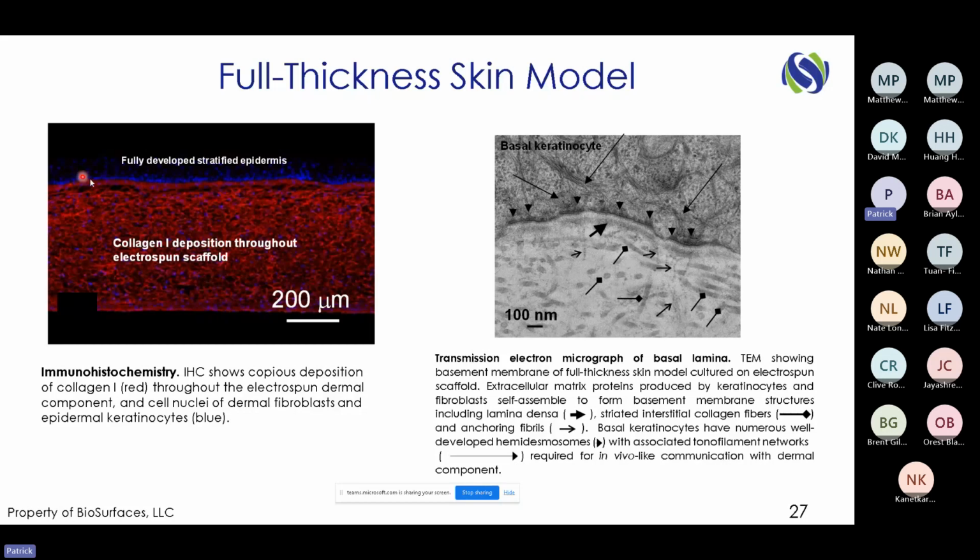And of course, this is where the epithelium is, and you can kind of see the Hoechst dye of the nuclei of those basal epithelial cells at the top. And then here's the basement membrane zone that I alluded to. It's very important to have a good basement membrane in your full thickness tissue models, because the basal cells, they know what they're binding to.